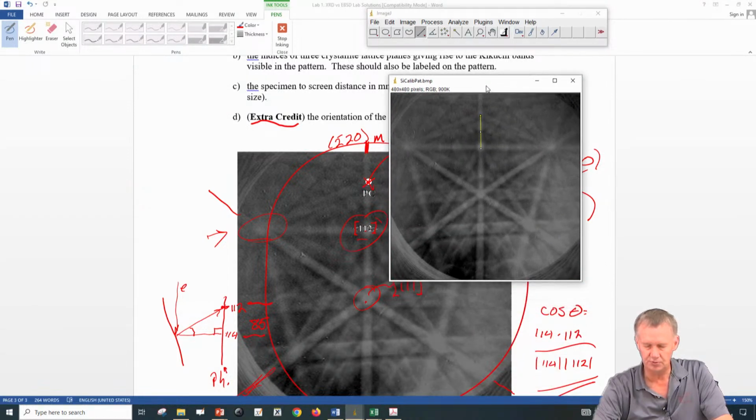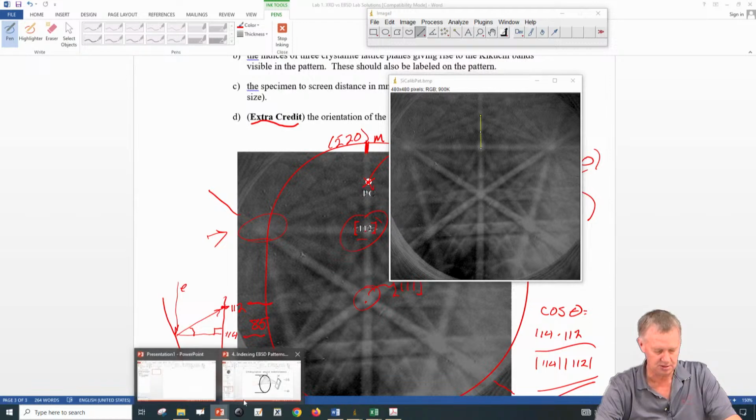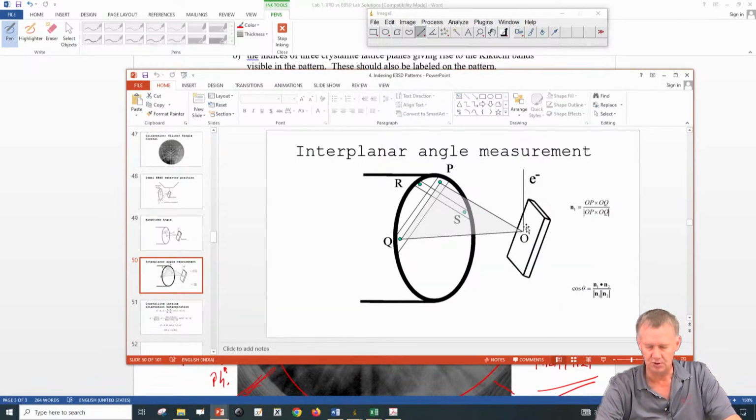Okay, bar 220. Now we need 2 points along here to figure out the normal. Do we really need those 2 points? We've lined it up so it's exactly lined up, and we know the normal is going to be right on the pattern center. Pattern center includes that line. So the normal direction is going to be pointing out this way. And if we do that in this coordinate frame that we're looking at, it's just going to be vertical. It's just going to be lined up.